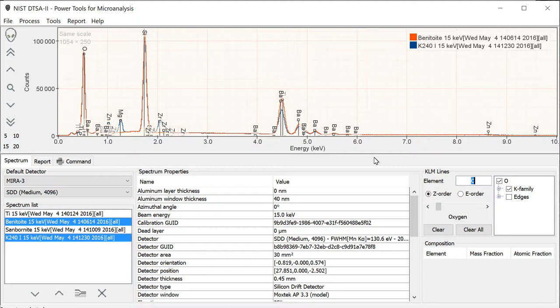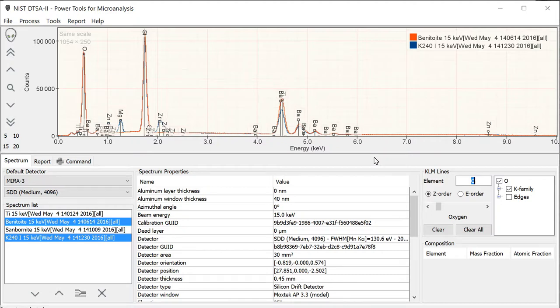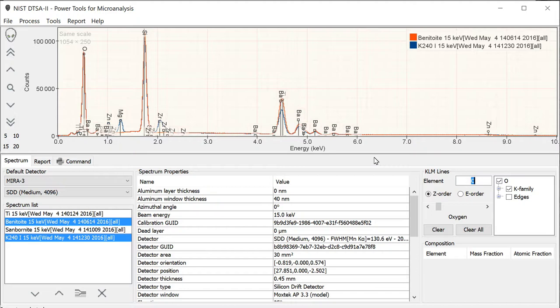Regardless of how the software developer designs the software, whether it's a commercial EDS package or something like NIST DTSA2, in the end all of X-ray microanalysis involves comparing unknown spectra back to some model or measured standard spectrum. This process usually involves spectrum fitting, so the unknown spectrum is fit with spectra representing the various elements in the unknown, and from those fits the composition of the unknown is determined.